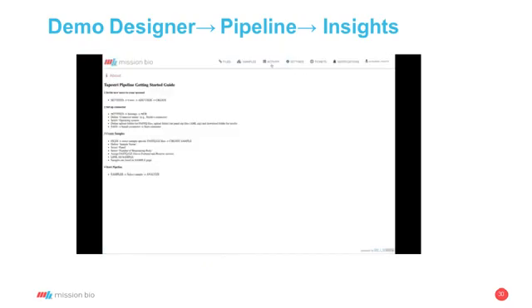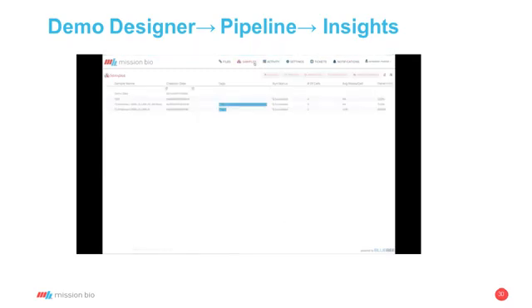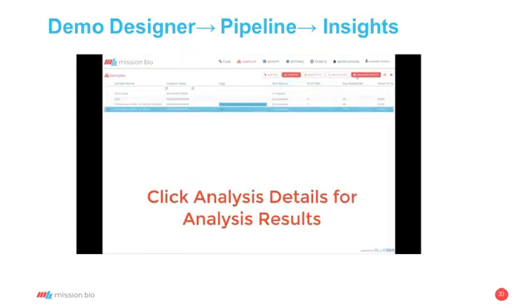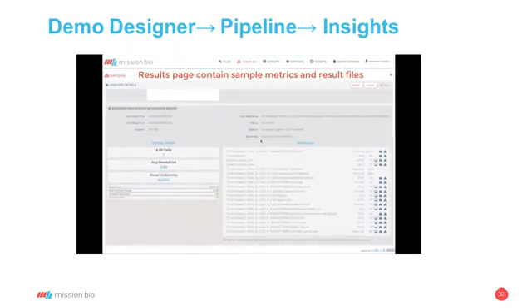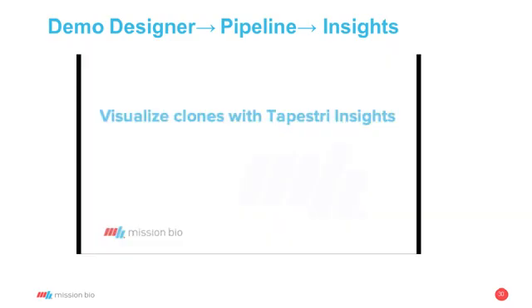The second part, this is fairly trivial. You're uploading your FASTQ files, creating your samples, and then selecting the samples that you want to process in the pipeline. This is where the mapping, cell calling, and then ultimately variant calling is being done. The typical run off of a HiSeq is going to take a few hours to run, so you kick it off and you wait for an email to come back to see your results page. So here you can download all of the data, look at a few key metrics that are important to qualify the run before you go into analysis.